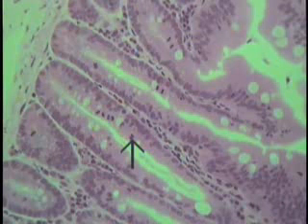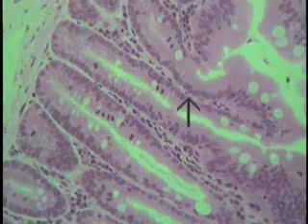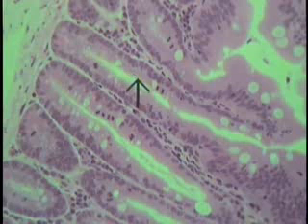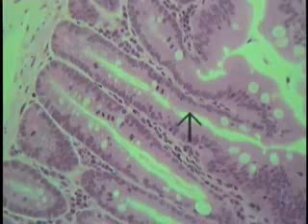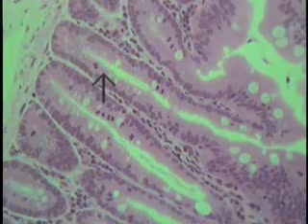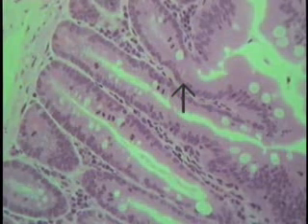This represents at increased magnification a simple tubular gland, as indicated by the pointer. Note, you can see it's made up of a cellular wall. The nuclear profile is indicated here by the tip of the pointer. And the cytoplasmic extent of these cells is also shown, which reaches about this far. Even at this magnification and intermediate power, numerous dark, intense staining objects can be made out. These are the chromosomes of several mitotic figures. Let's look at these at increased magnification.